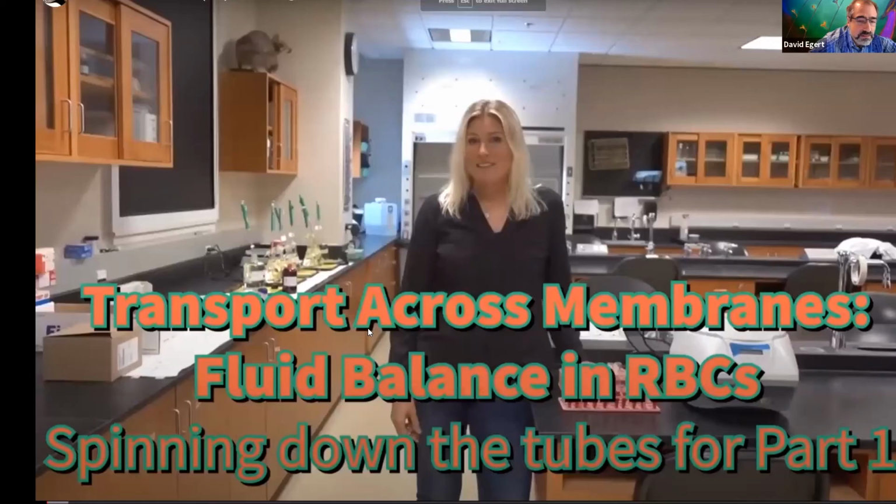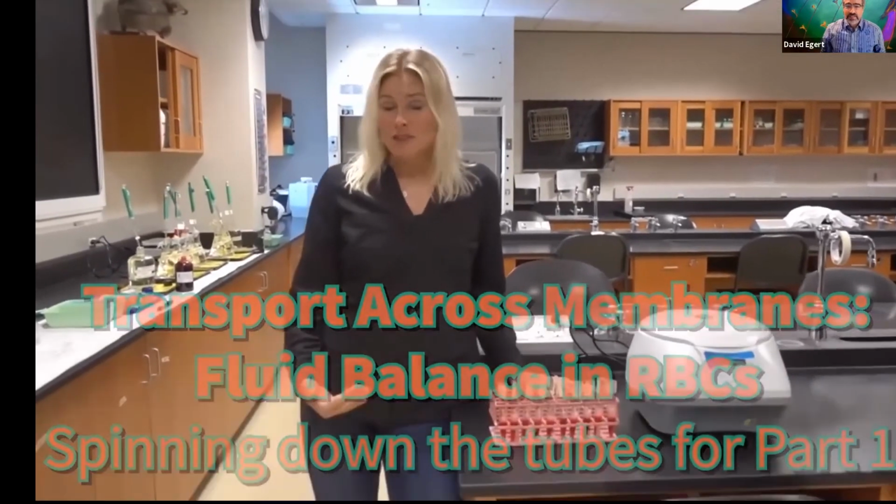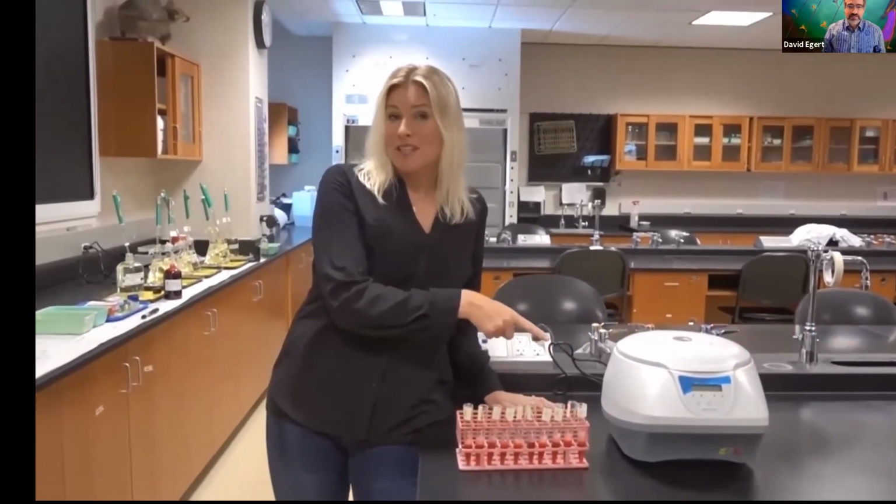All right, so next we're going to centrifuge these test tubes. Unfortunately, we have more test tubes than we can finish in one round.